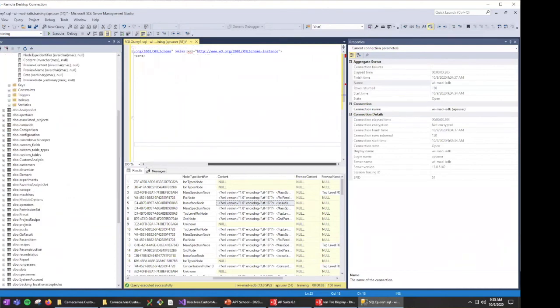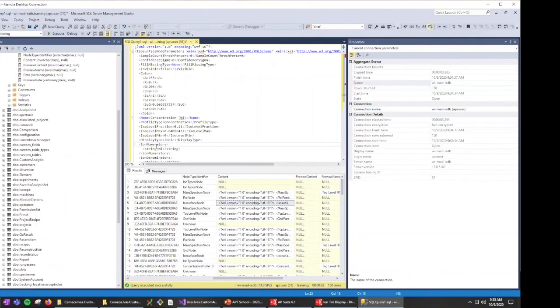And as a paid option, not only can you automatically generate reconstructions, you can also generate analyses. So if you wanted to run your custom analysis automatically at the end of every run, you can do that with an option that does not come with the free one, but I guess I'm putting my sales hat on here. I promised no sales talk in this meeting.